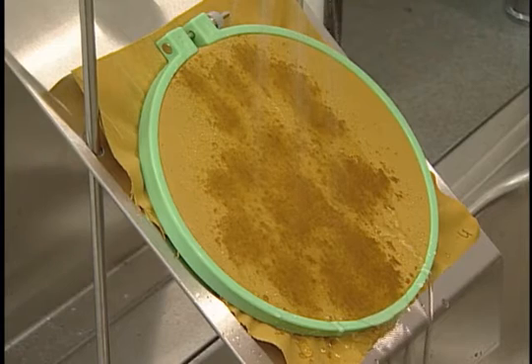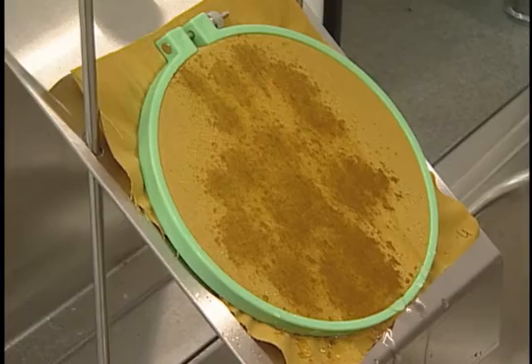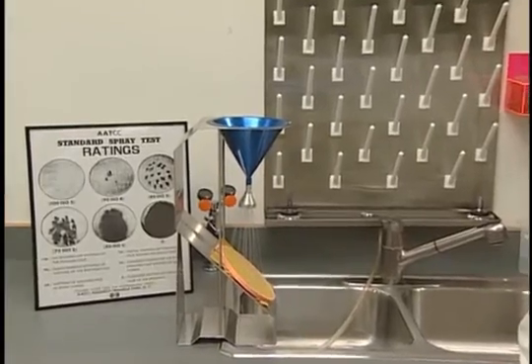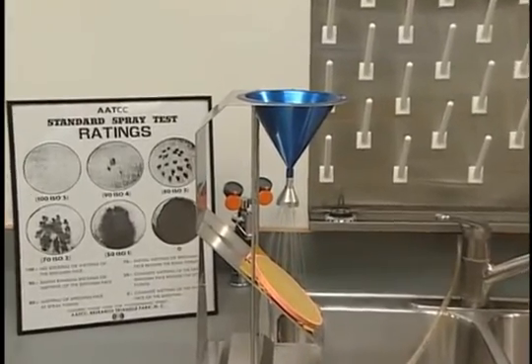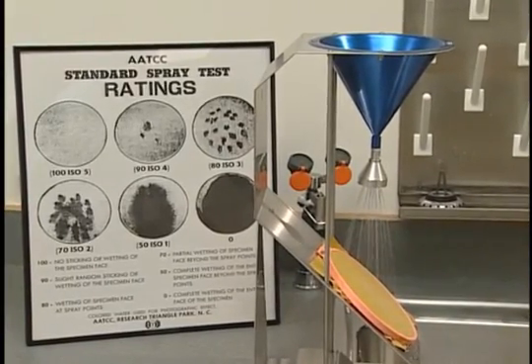The comparable ISO numerical grade scale is 5 to 0. Most performance specifications for water repellency have 90 as the minimum acceptance grade level using test method 22.